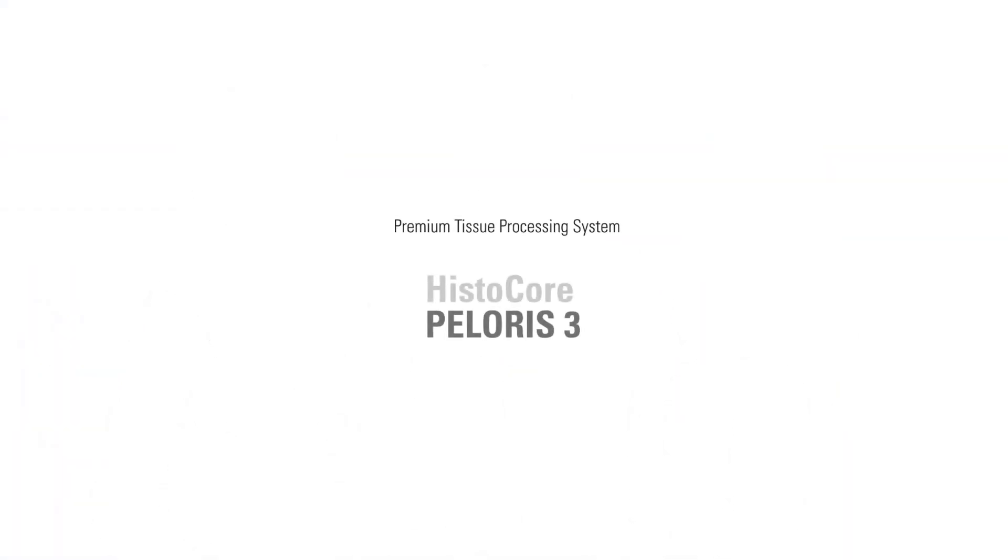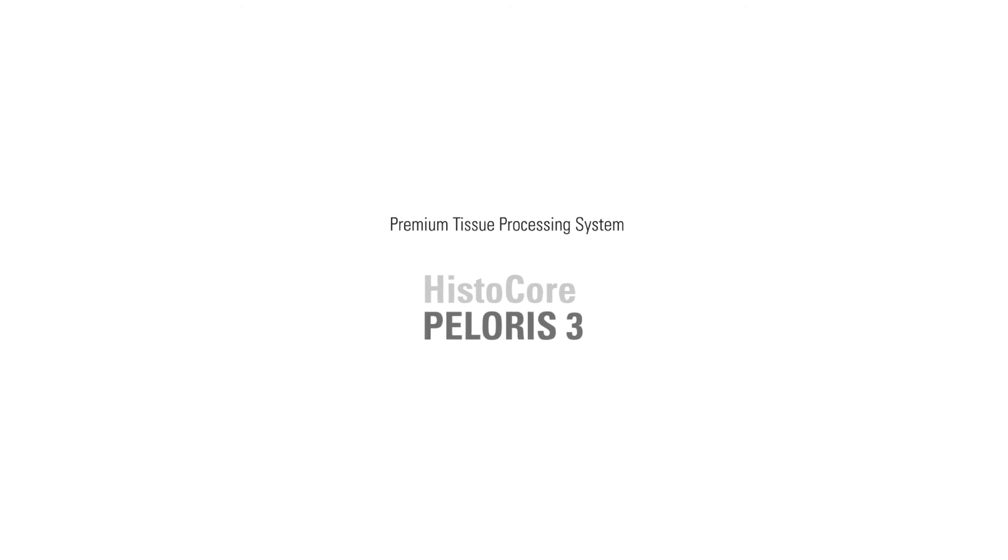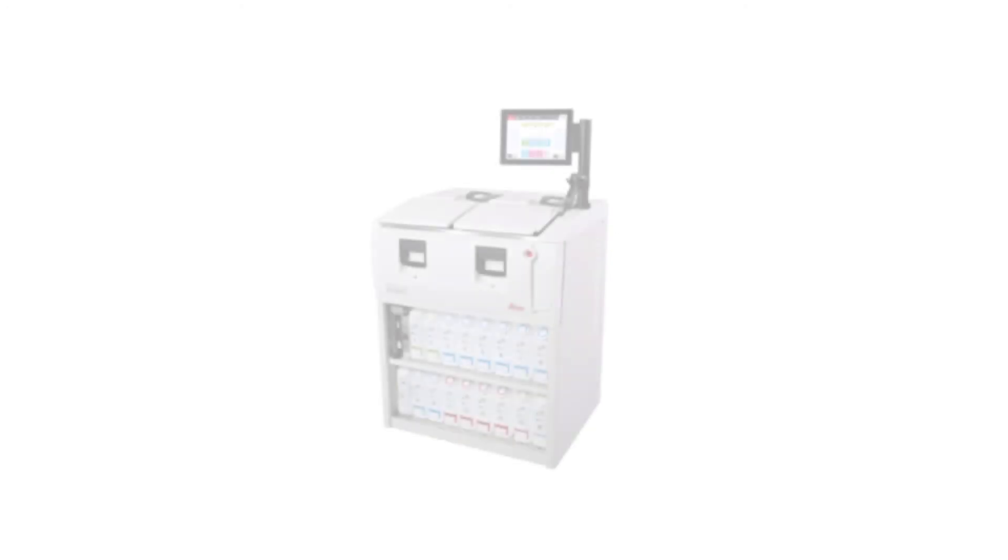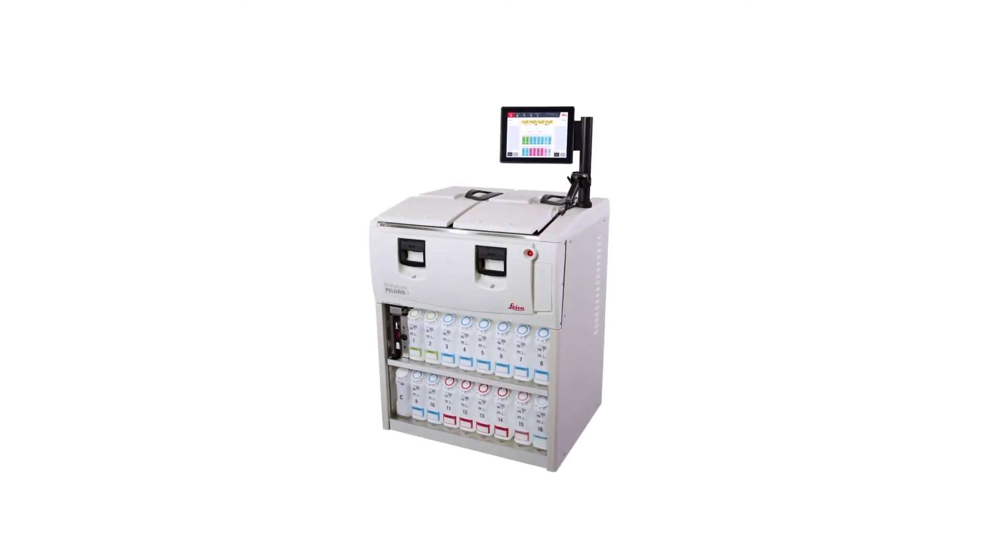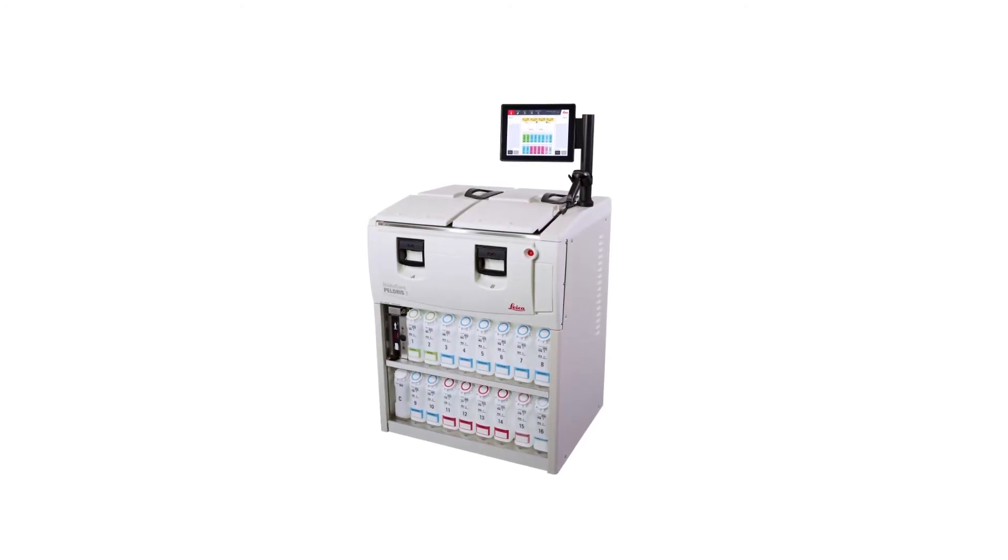With added track and trace functionality, PELORIS 3 provides the accountability and high quality your lab requires.